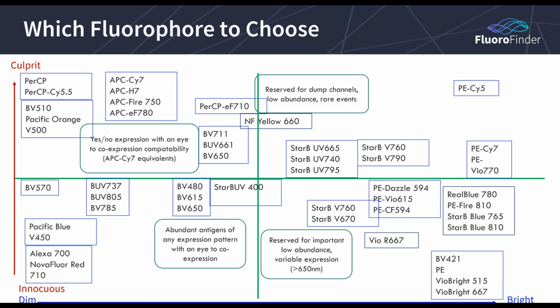So I'm just going to leave this with you. It's in the PDF handout for this talk. I think I'll eventually make this into something that's easier for us to reference, because it's probably the number one question that I get from people when I'm teaching: I simply don't know the difference between the fluorophores in order to choose them for the right application or for the right marker. And I totally get that. I've been working with fluors my entire career, so that's second nature to me. We have to figure out a way to make it easier to access.